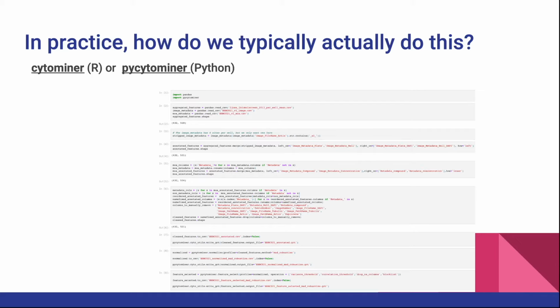And it's zoomed out here because I don't really want you to focus on the details. I want you to just note that there's actually only 2 required steps here, and at most 4 steps to go between that. So even if you're not very comfortable with using these sorts of command line tools, it's actually not that difficult, and there's not that much code that needs to be written. The first step is just to import your libraries and your data.